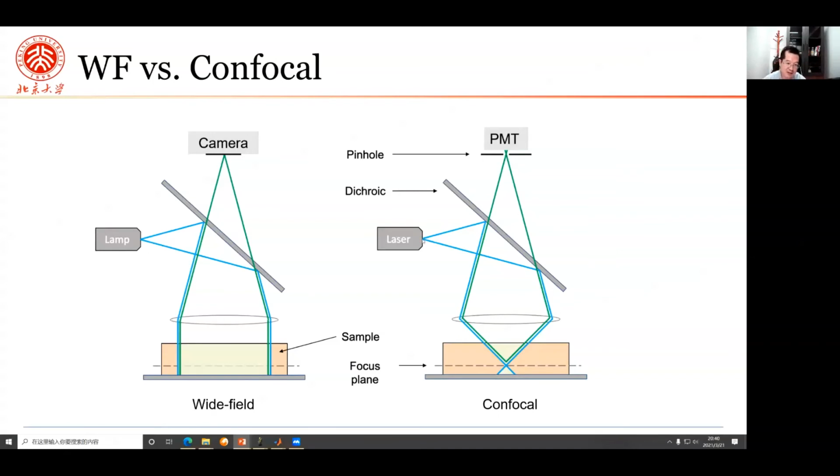We can well understand that the laser, being a point, after this microscope will be converted to a PSF, a point spread function. But how about the pinhole? If you shrink the pinhole really, really tiny into a spot, you will find that if you can illuminate from this pinhole, it will also generate another point spread function here.